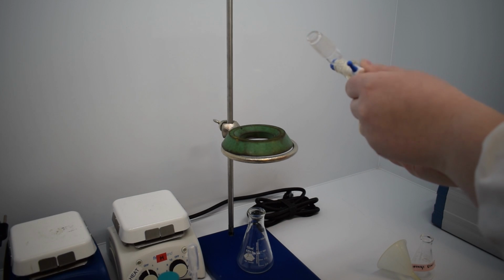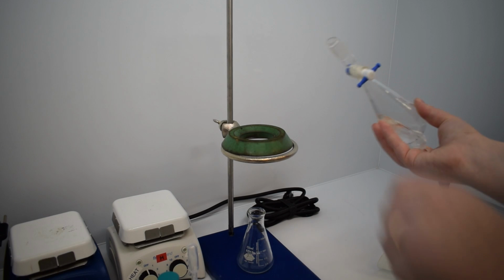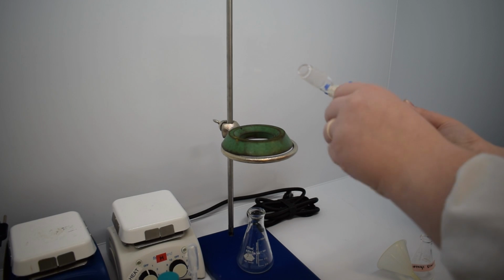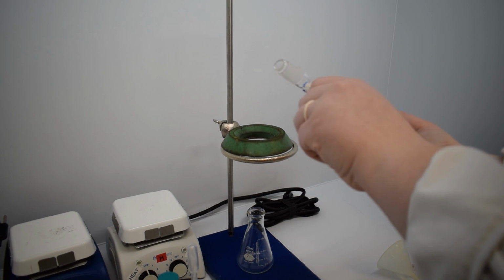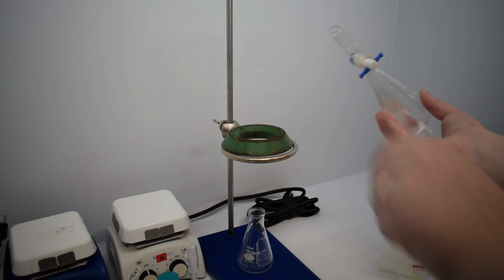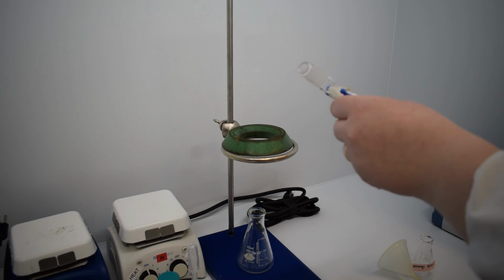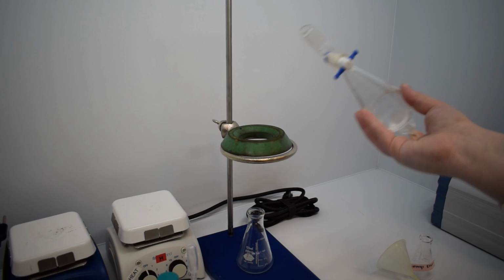The first time you do this, you want to take the separatory funnel with your finger on the cap firmly and slowly invert it upside down, vent it, and then gently invert it and vent it each time. You'll notice when you vent the first few times especially, there's this little pop sound like you're opening a soda bottle for the first time.